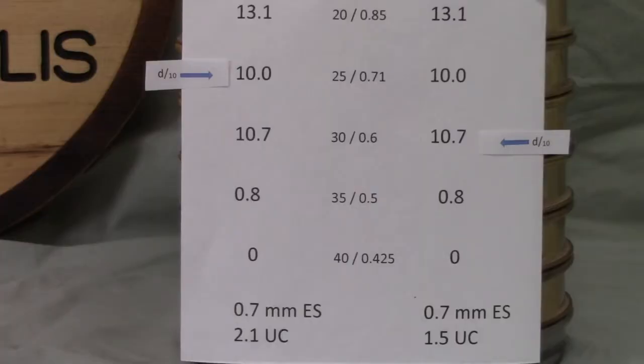The two most common terms used in the assessment of granular material to be used in water and wastewater filtration are effective size and uniformity coefficient. When we've completed our sieve analysis and entered the data into an Excel spreadsheet, we look at the grams or percent of material retained on each sieve stack, and from that we can determine the effective size.